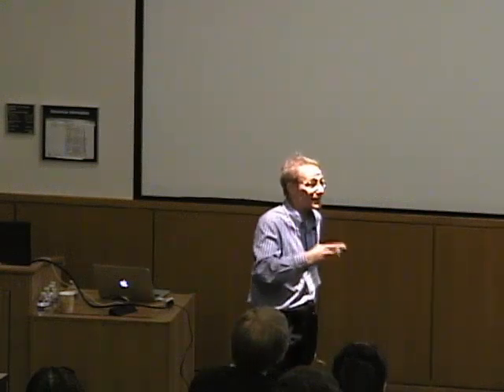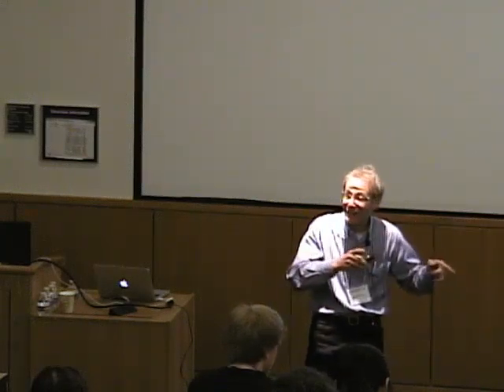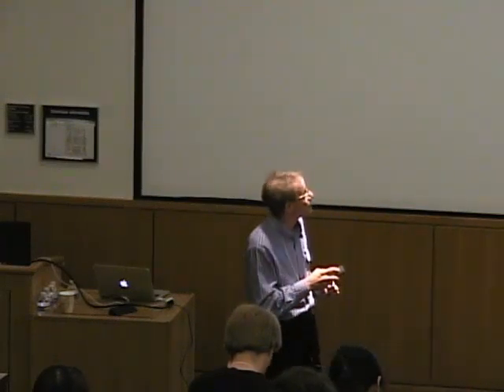Okay? Intermediate information, okay, determining the enthalpy. That's what the technique is designed to do, but there's a caveat. You're measuring all the heat of everything that happens in that cell when you add the aliquot. So you have to be very careful about interpreting that, and oftentimes, certainly in our field, there's going to be some analysis of the data afterwards to pull out the enthalpy of the molecular phenomena that you're trying to measure.